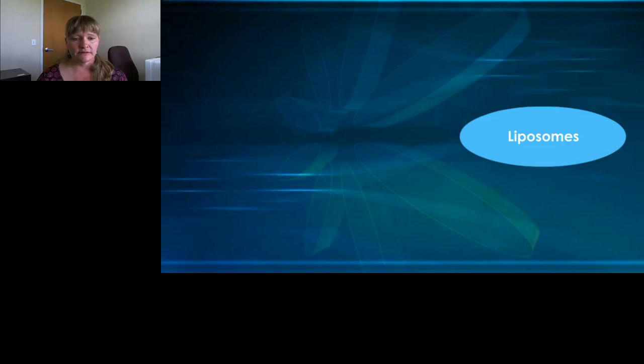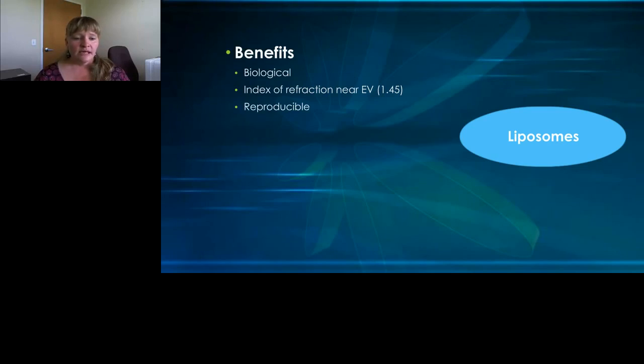Fluorescence. The DII liposomes had a higher fluorescence value than noise. Benefits to using liposomes as a calibration standard. They are biological. The index of refraction is near EVs at 1.45. They're reproducible. Additional dyes can be either packaged inside the liposome or attached to the membrane.